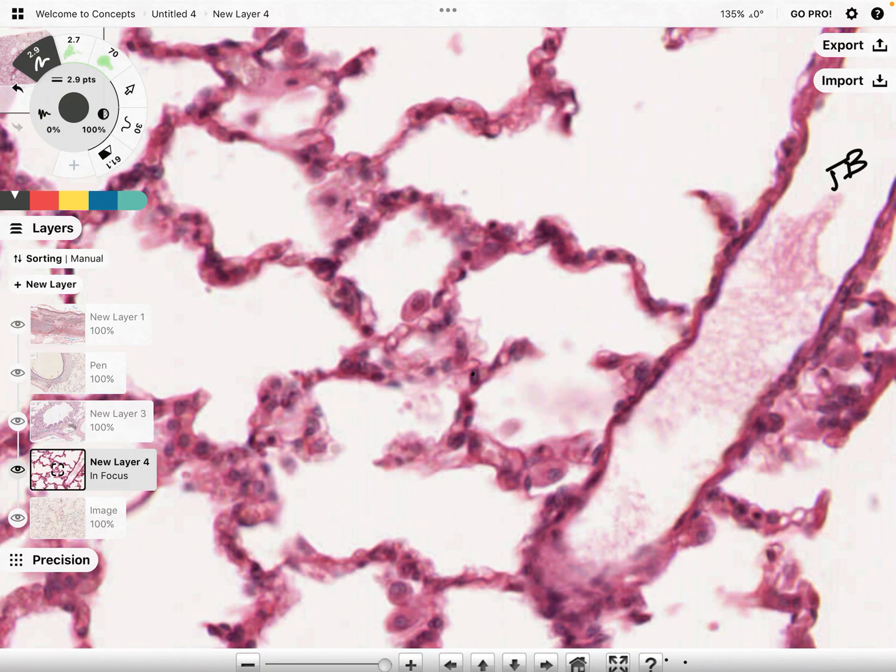Okay, the last one we're going to talk about here. So this could be part of a terminal bronchiole coming in, but definitely this would be the alveolar duct in my opinion. So I'm going to denote that with the AD. There is some cellular stuff in here, but it doesn't look like actual red blood cells. So to me, I think this is just some of the tissue and some of the cellular stuff that got stained. So it looks like it's filling these spaces. And indeed, it being three-dimensional, it is filling these spaces. But it doesn't look like red blood cells, so I definitely don't think we're looking at a blood vessel. We would see some other structures that would definitely stand out, aside from red blood cells in there.